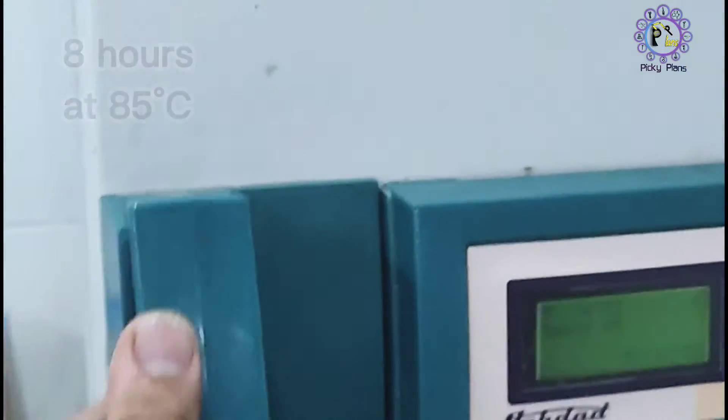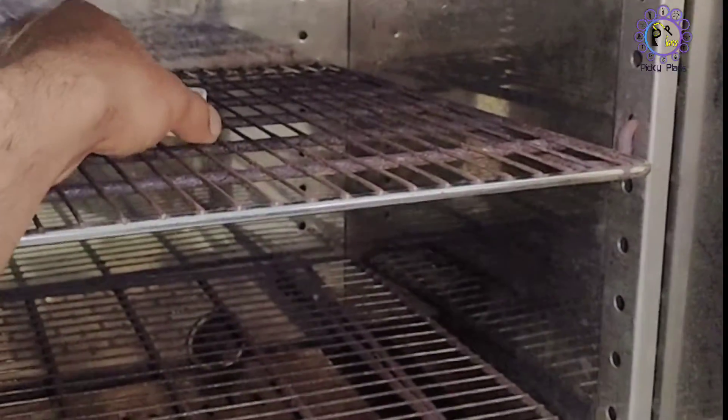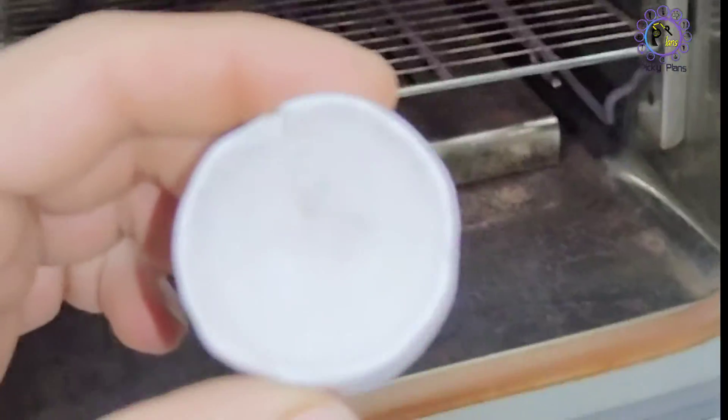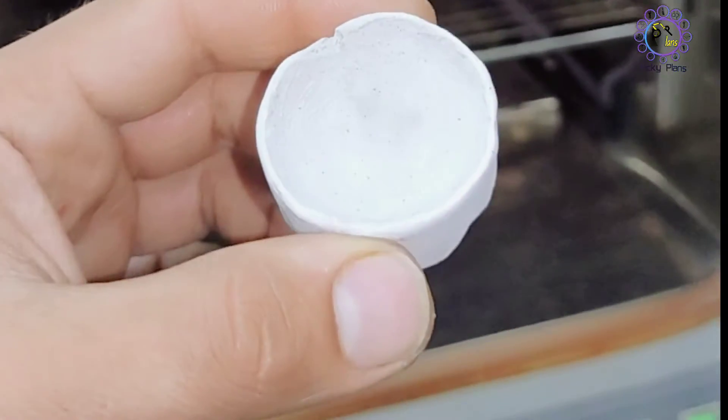Afterwards, we should place it in the oven at a temperature of 85 degrees Celsius for 8 hours to remove any remaining trace of water. I use a lab oven, but you can use a kitchen oven instead. The crucible should be dried as much as possible before putting it in the oven.